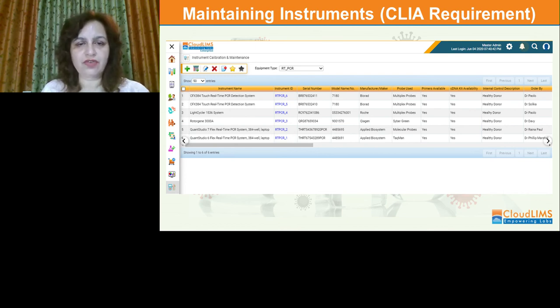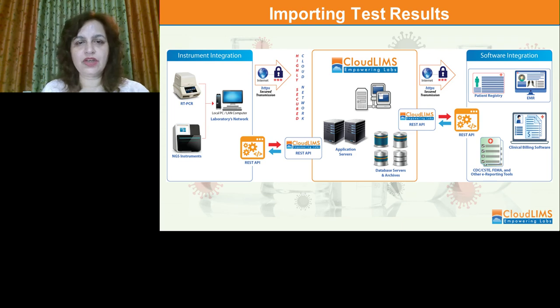One of the chief jobs of a LIMS is to integrate with instruments that are available in the lab, primarily for maintaining data integrity and for maintaining efficiency in the lab. A LIMS should upload time-stamped reports being generated by these instruments so that time is not lost in entering the information manually and the results reported are accurate.